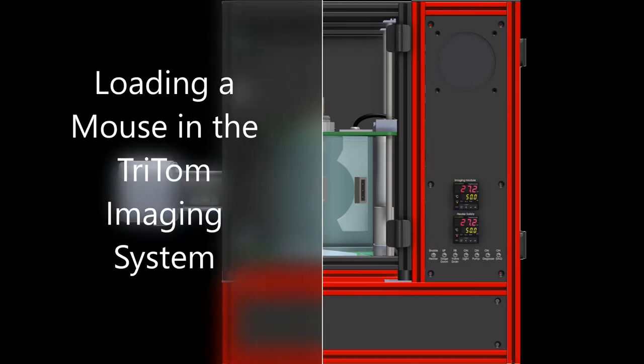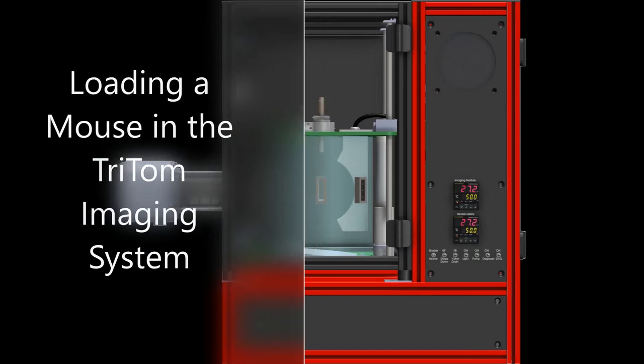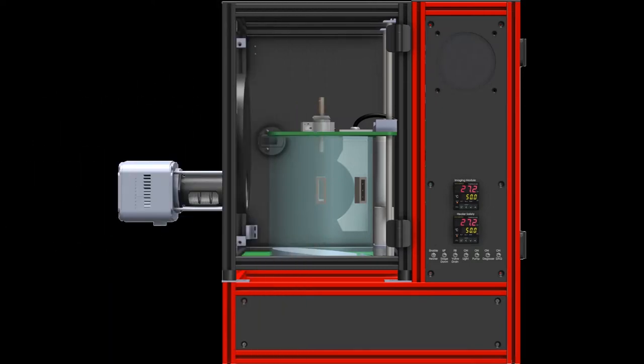This video demonstrates how to load a mouse in the TriTom Small Animal Imaging Platform for an in vivo imaging experiment. Photosound Technologies recommends that users test these procedures prior to an in vivo imaging experiment to determine the target gas flow rates for their system.